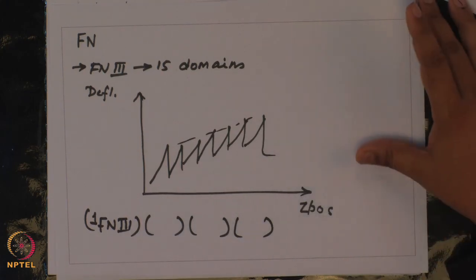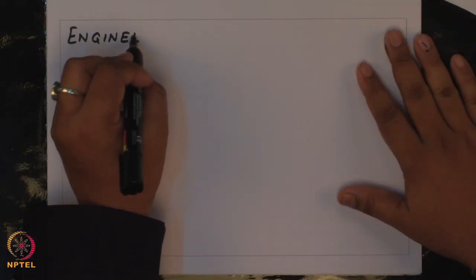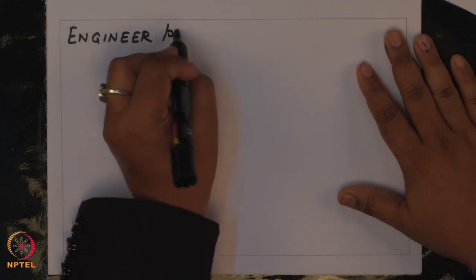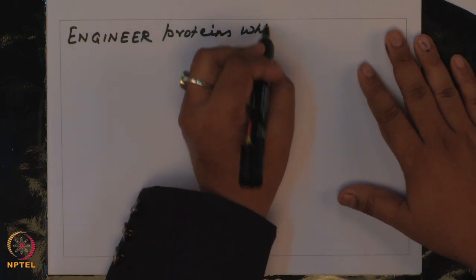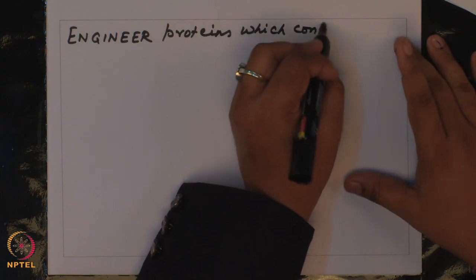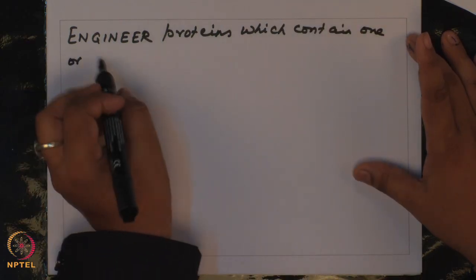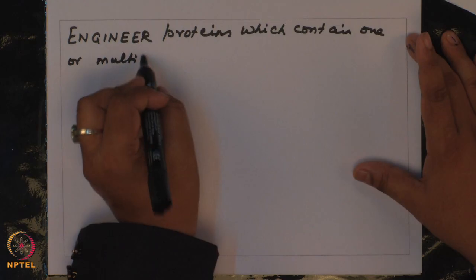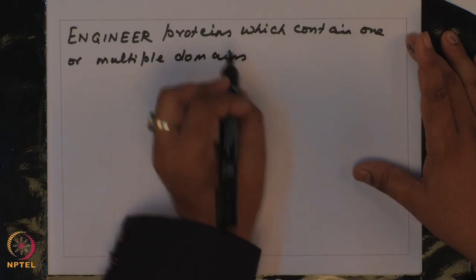So, you prepare this, you engineer these proteins which contain one or multiple domains repeating.